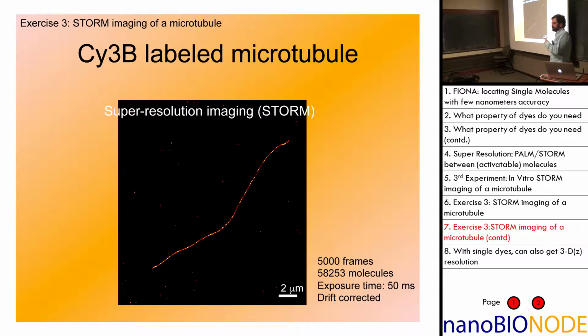This is looking at only two dimensions. It looks in the X, Y, because that's what you're doing. However, you would really like to see in 3 dimensions, X, Y, and then Z. The question is, can you get this? And the answer is, yes, you can. In fact, you can get it amazingly easy.